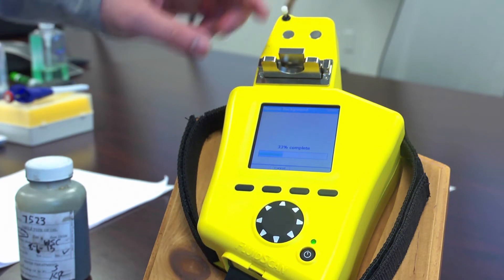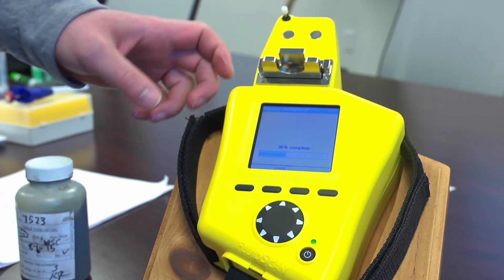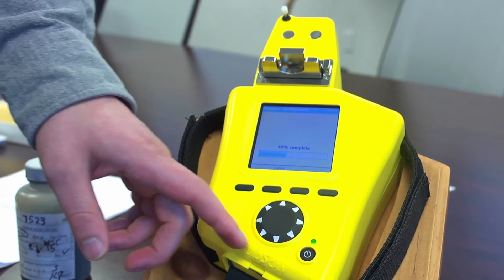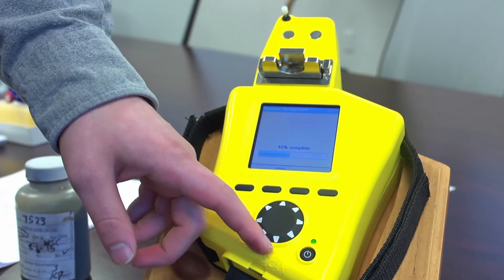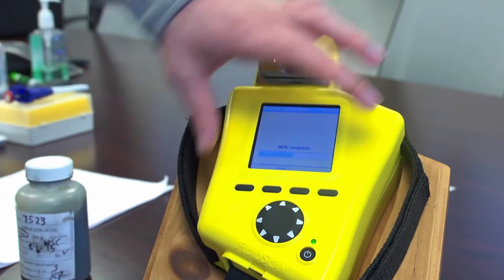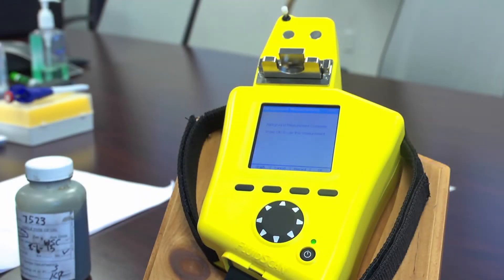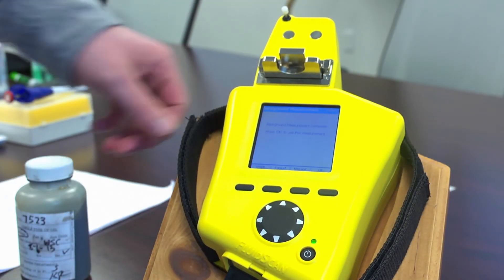Once the IR laser goes through the flip top cell, it then goes on to the wedge portion of the device which breaks up into the spectra. Once background measurement is complete we hit OK.